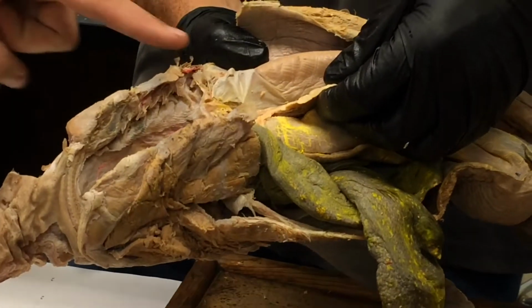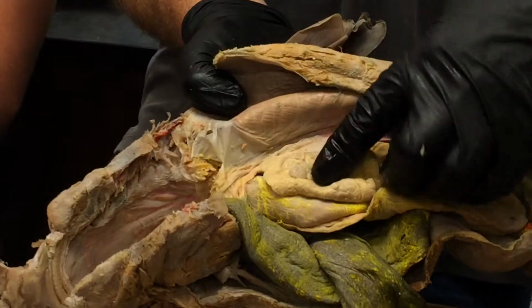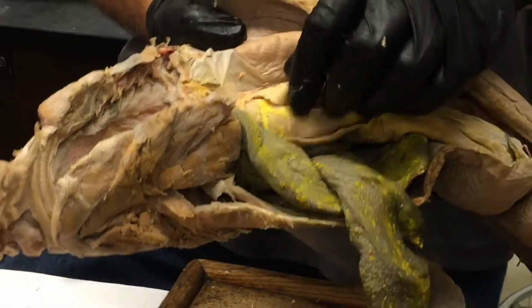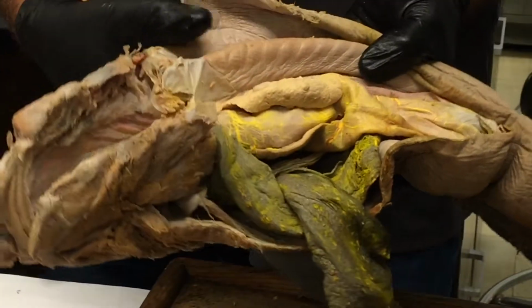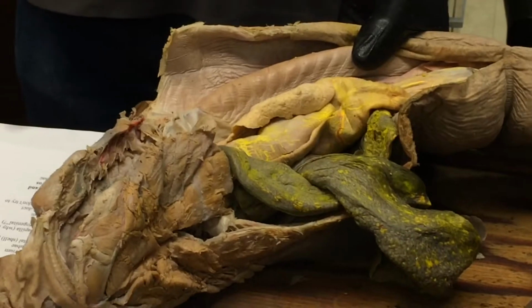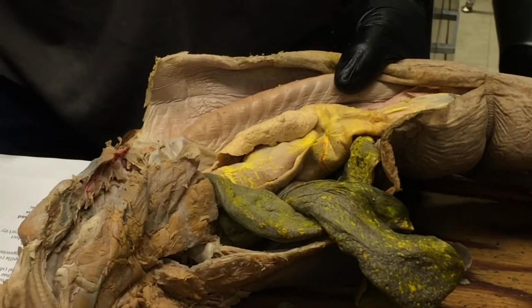Okay. What is that, Professor? Just, yeah, that's a developing egg right there. Oh wow, that's so cool. Little round thing. Yeah, actually looks like a piece of dog food. I can't believe how big they are. Well, I mean, they get way bigger than that, right? They get huge. I thought that they didn't get that big until they're fertilized. Oh, no, they don't get bigger after they're ovulated. There's no way for them to get bigger. So they're as big as that when they come out of the ovary. Oh my gosh.